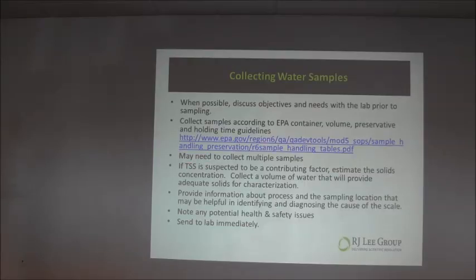As you look through this, if you're looking at different analytes, you may have to collect more than one sample. For example, if you're looking at metals, you want to acidify the sample typically so that they don't precipitate out. You don't have iron hydroxides precipitate out, things like that. But if you acidify the sample, if there's TSS there, you're probably going to push some of the TSS into solution. It's going to change your TSS concentration. Certainly going to change your pH, right? So if you're getting different analyses, you want to look at what needs done to fit the bill for each of those type of parameters.